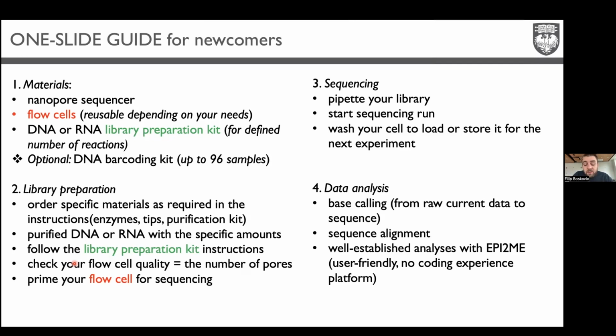Don't get me wrong, you can sequence, particularly for plasmid sequencing or something that's a low throughput need. You can actually use those, but you can then ask the company to send you new flow cells because those didn't meet their criteria. So in that sense, they're really nice. If for some reason the flow cells have lower quality, you still can use them. You don't need to return them. But you will get a completely new batch.